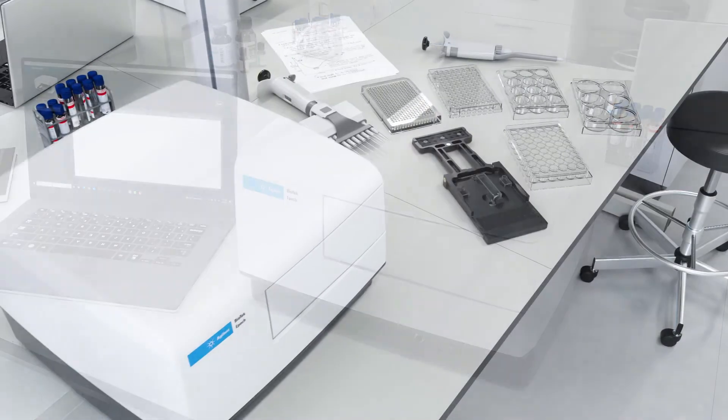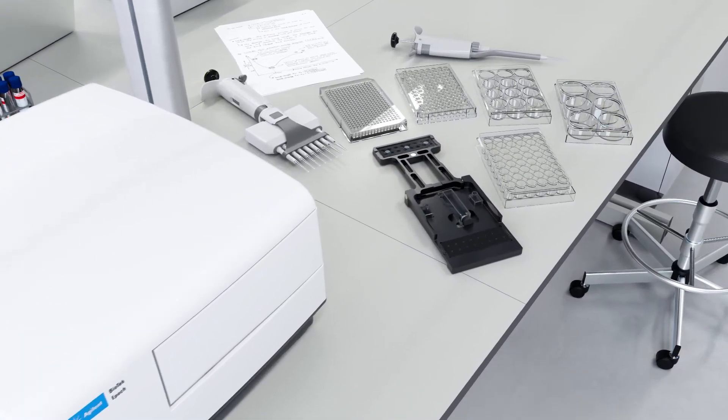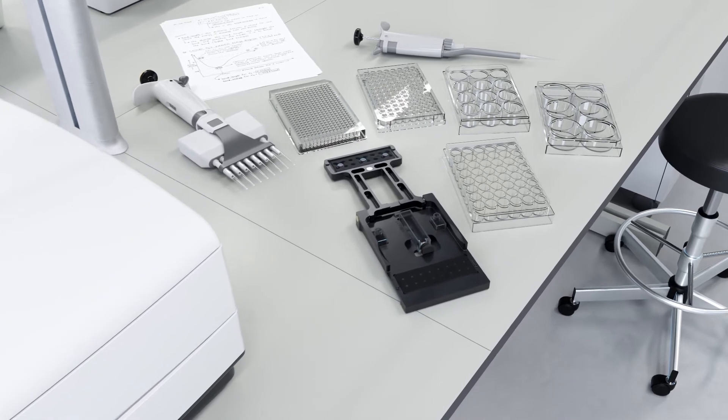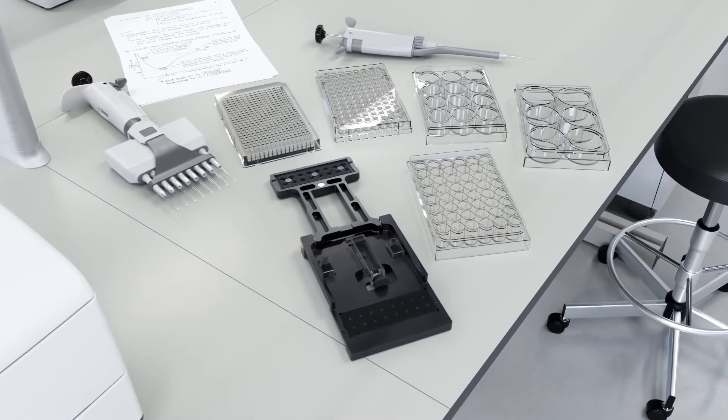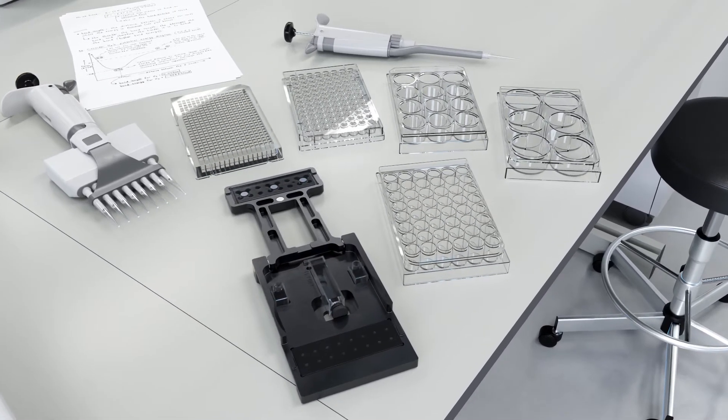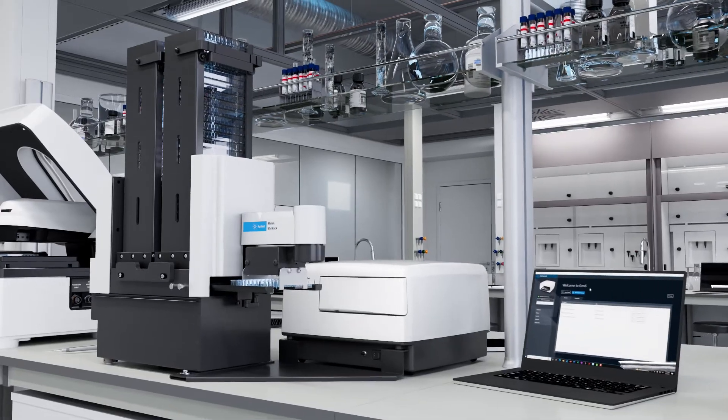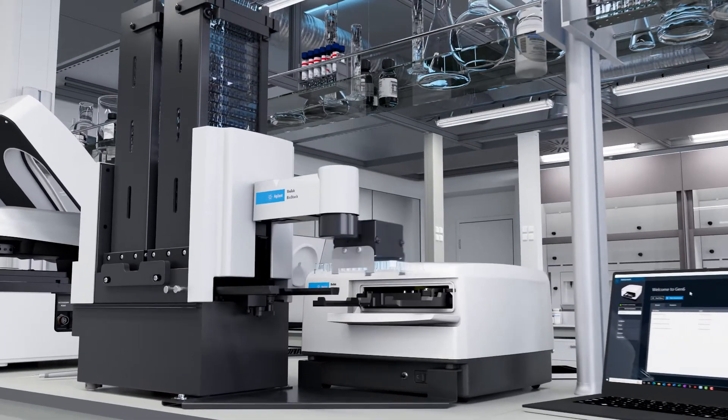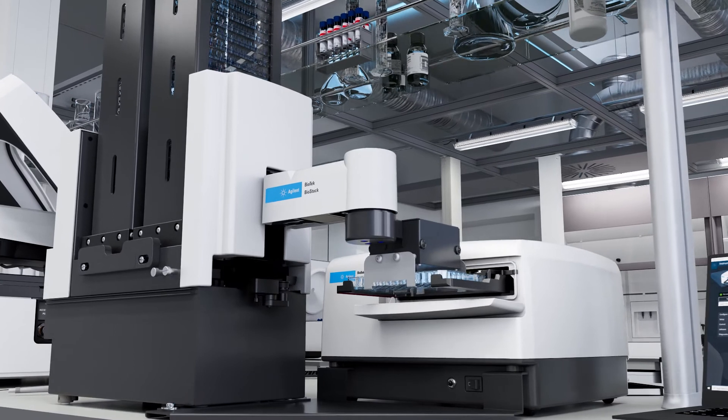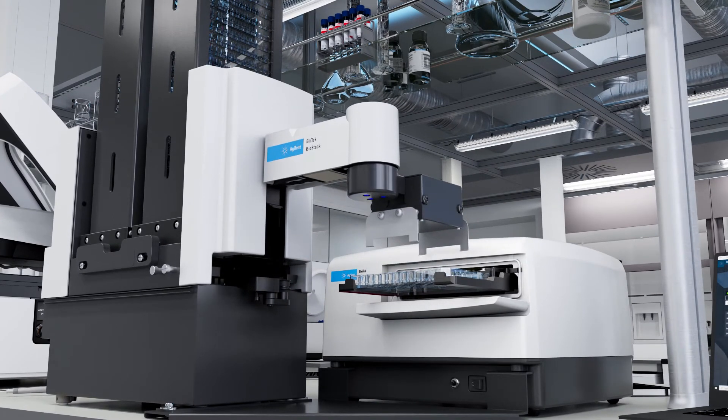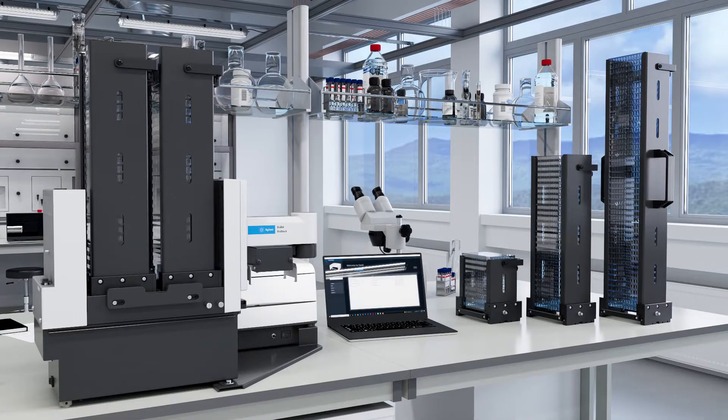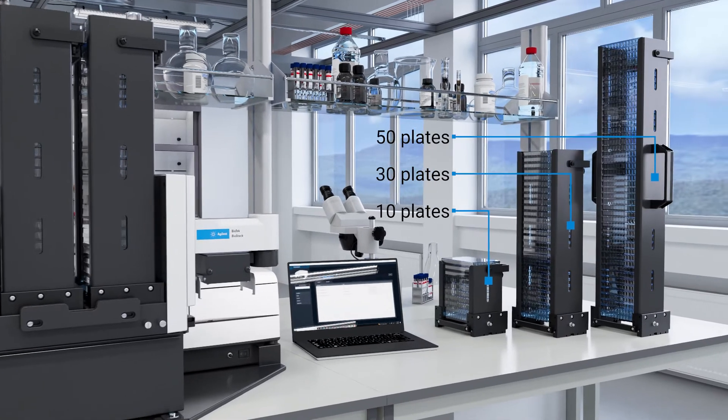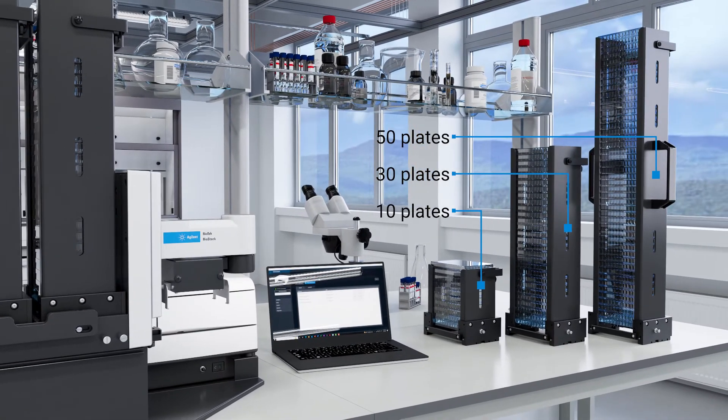Epic can measure absorbance values in microplates from 6 to 384 wells, with volumes ranging from a single µL to hundreds of µL. To automate reading processes for multiple plates, a robot-friendly configuration of Epic interfaces with the BioStack microplate stacker. Process 10, 30, or 50 microplates automatically and efficiently, freeing you for other tasks.